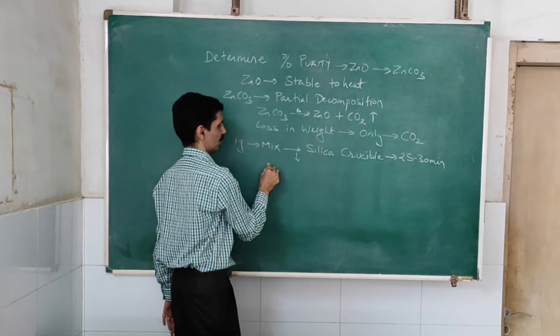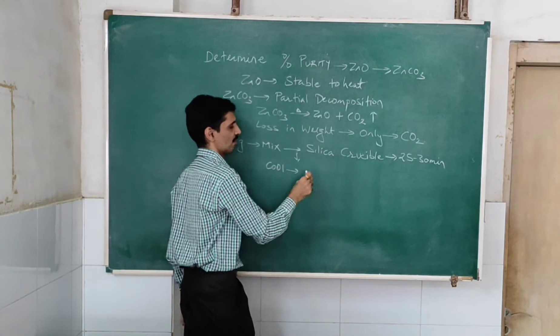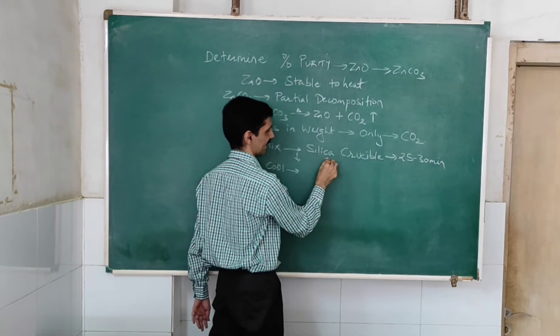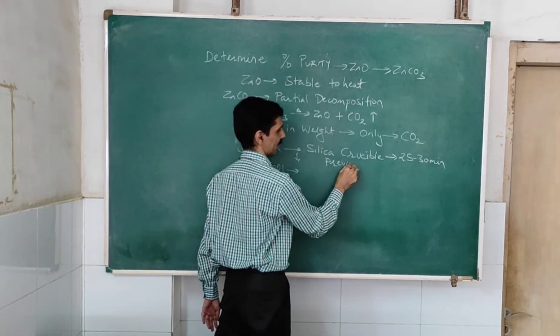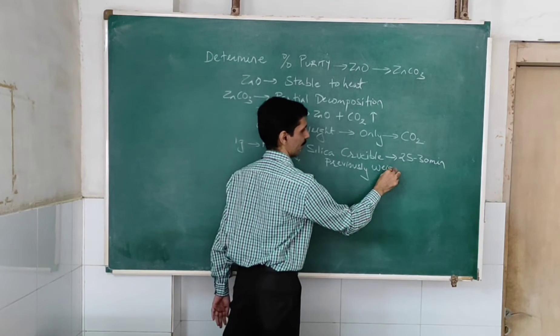Next, you need to cool the crucible. Now, this silica crucible has to be previously weighed, because weight is very important when it comes to gravimetric method.